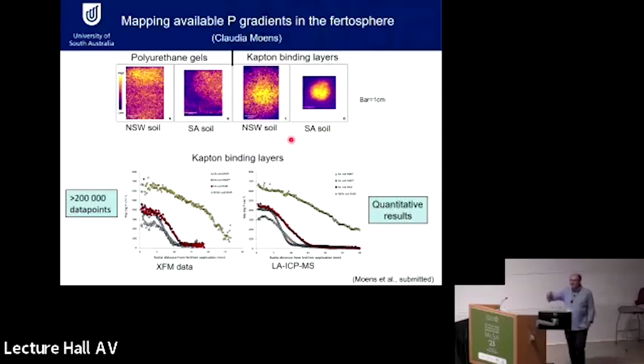We also do the analysis in a different way. Again, yesterday people were asking about what kind of programs you can use. There are a lot of programs out there at beam lines, but when you extract your data, you can use ImageJ for data analysis. ImageJ is a bit like R for statisticians. It's open source, there are a lot of plugins, and there is a lot of stuff that you can do.